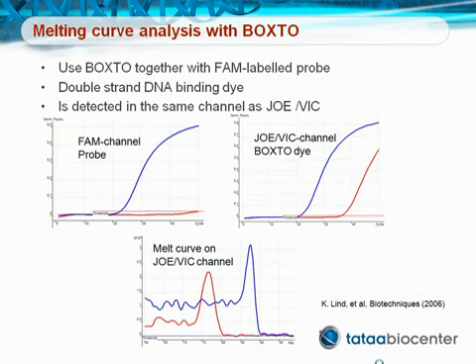As you can see here, the probe is not detecting any primer dimers. The red curve, which is the NTC, is not crossing the threshold. However, when we look in the melting curve measured on the JOE or VIC channel, we clearly see a peak also from this reaction. The positive sample, the blue curve, does not contain any primer dimers though, and that is good.